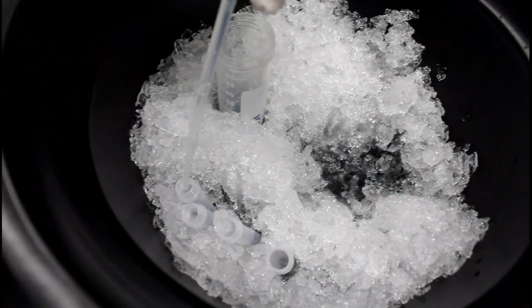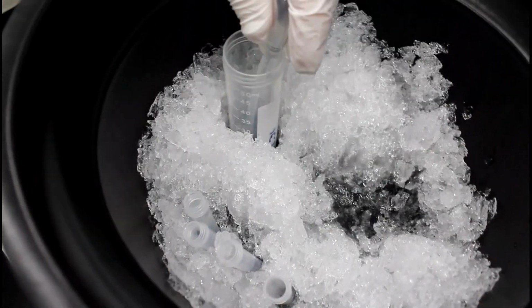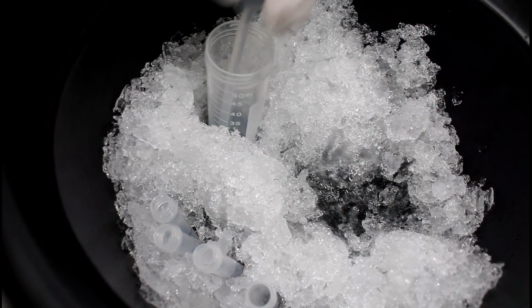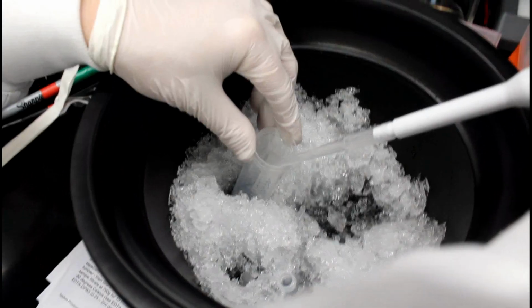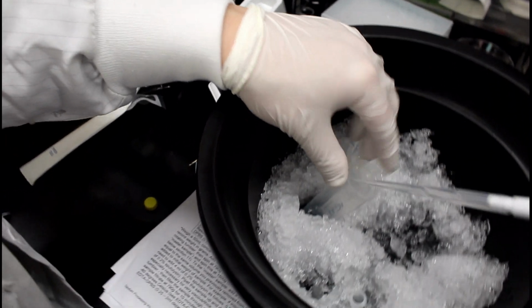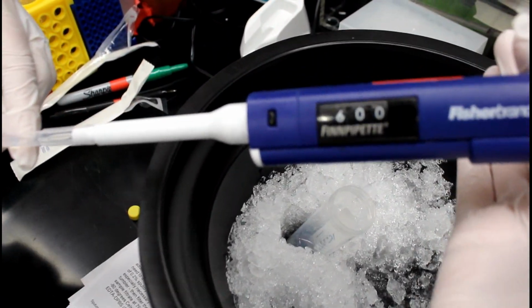If the sample volume is greater than 8.6 mLs, which it is in this example, obtain 4 1000 microliter aliquots for nucleotides, 4 1000 microliter aliquots for cytokines. Of the remaining sample, take 600 microliters and mix it with 600 microliters of Zymo Research RNA-DNA Shield.